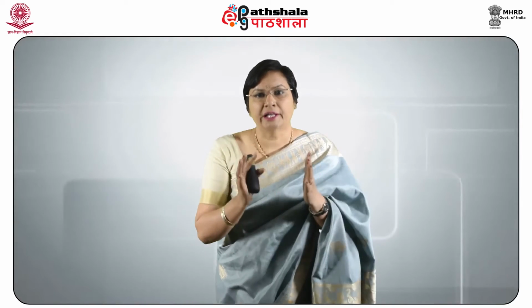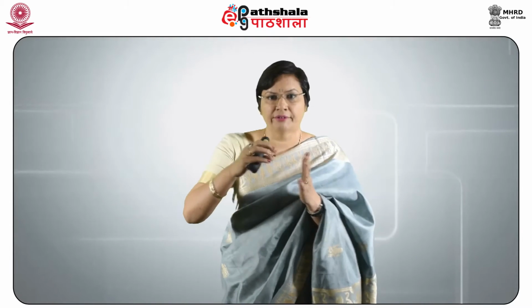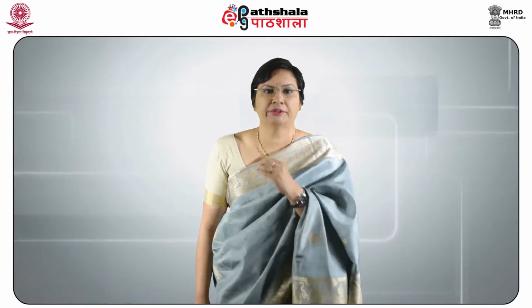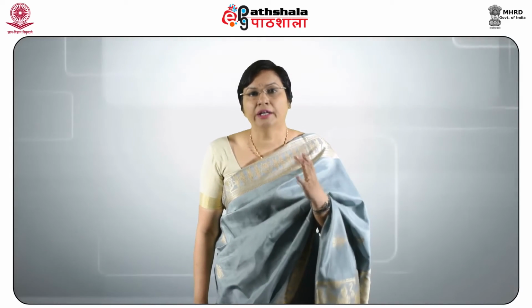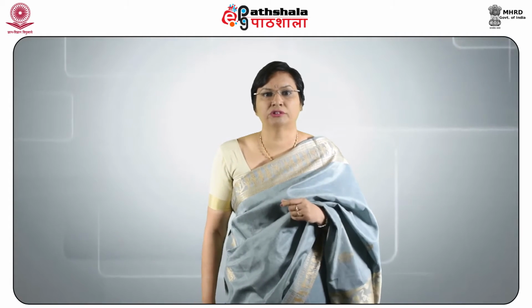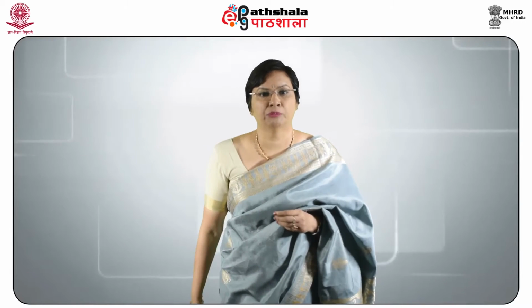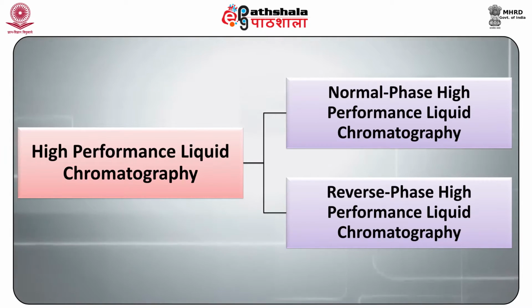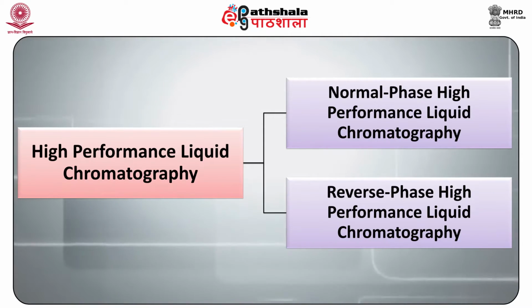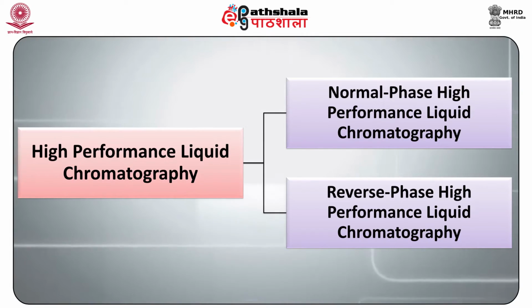And so this is a type of column chromatography in which a solvent with the chemicals of interest is forced through a thin column at very high pressure. So that's the name high performance, or sometimes high pressure, liquid chromatography. The compounds are then separated out based on molecular size and polarity, and there are two types of high performance liquid chromatography. One is the normal phase HPLC and the other is the reverse phase HPLC.